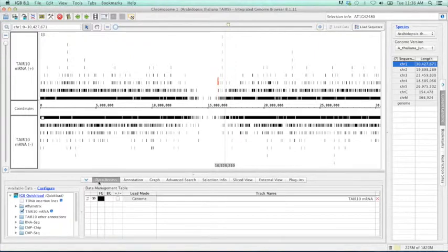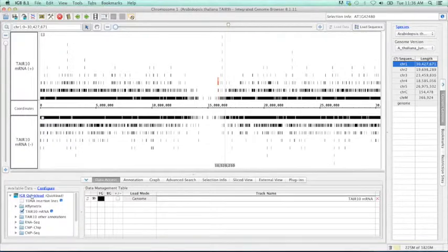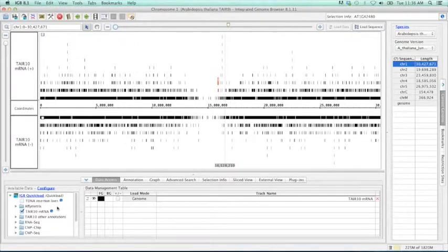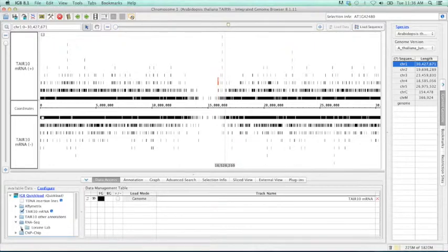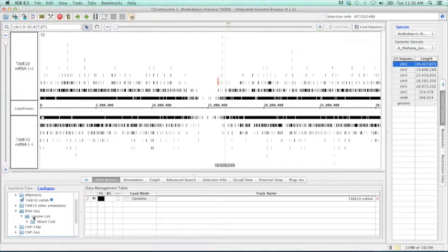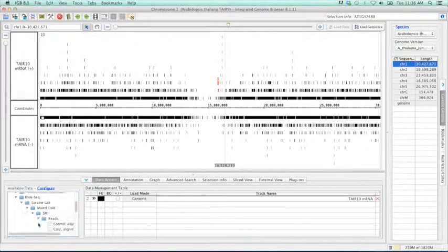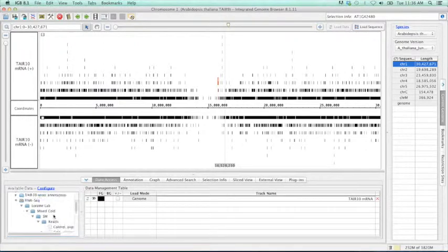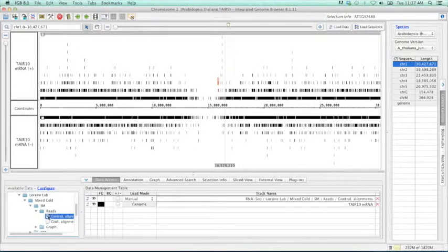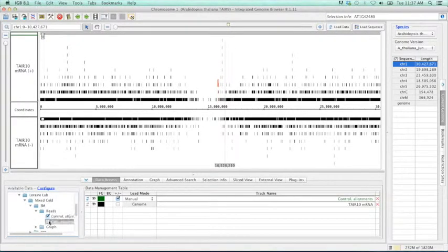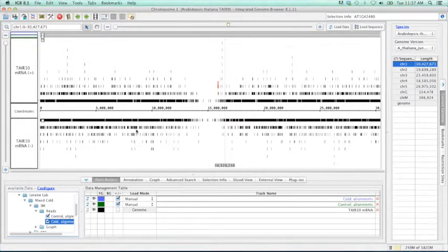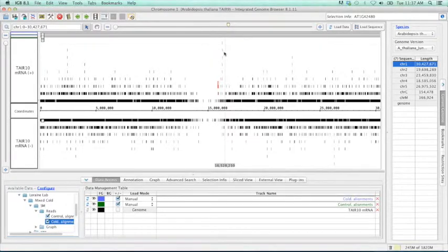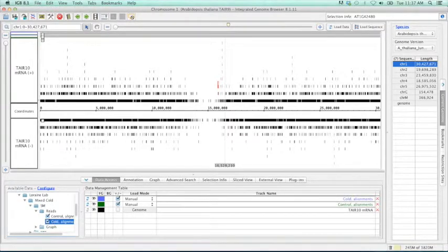In the data access tab, go to the available data. You'll see here that we have IGB QuickLoad. Go to the RNA-seq, Loraine Lab, mixed cold, SM for single maps, reads. And what we're going to load is the control and cold alignments. As you can see here at the top, we've loaded both of these tracks in, but they both appear grayed out. This is correct as these files are quite large and could overload your system by trying to load all of the data at once.